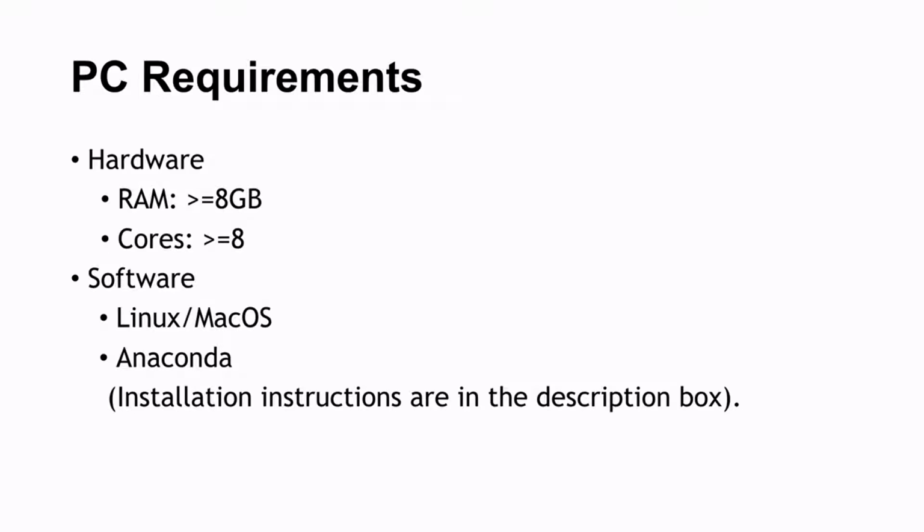You also need to have Anaconda installed. We will use Anaconda to install the tools that we use for this exercise. Anaconda makes life easy when it comes to software installation. So just make sure you install it.